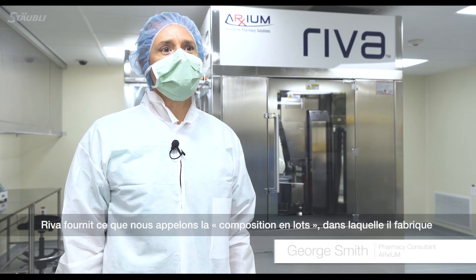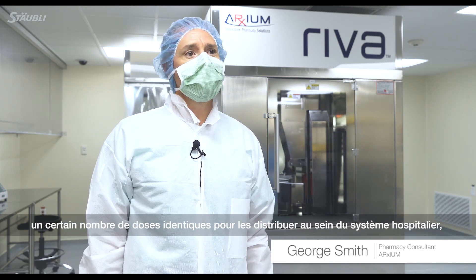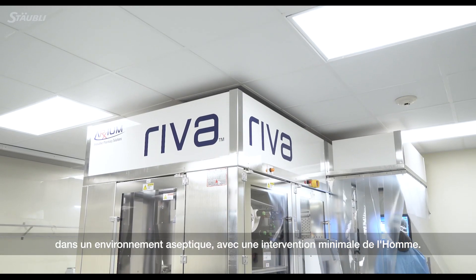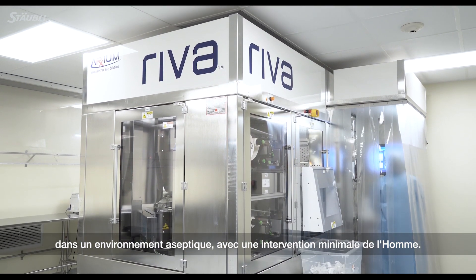Reva provides what we call batch compounding, in which it makes a number of the same doses for distribution amongst their hospital system in an environment that is aseptic and with minimal intervention from humans.